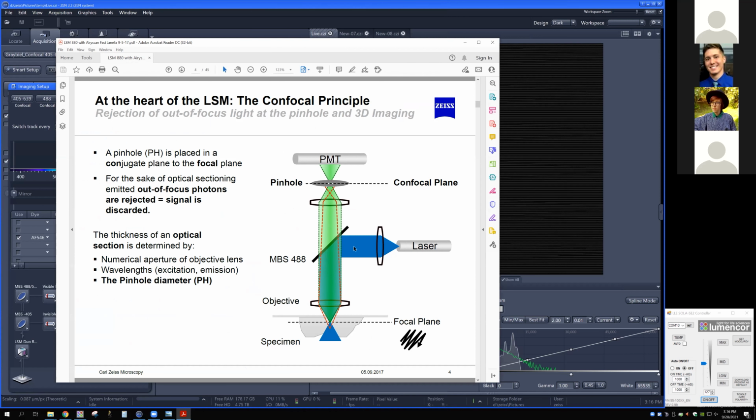It's already a very select wavelength, so we don't need an excitation filter to trim that down. So we go basically straight to the dichroic, and this guides our excitation light down to the sample. The sample fluoresces, the fluorescent signal comes back, passes across the dichroic, and either goes through filters or through our prism set to reach the detector.